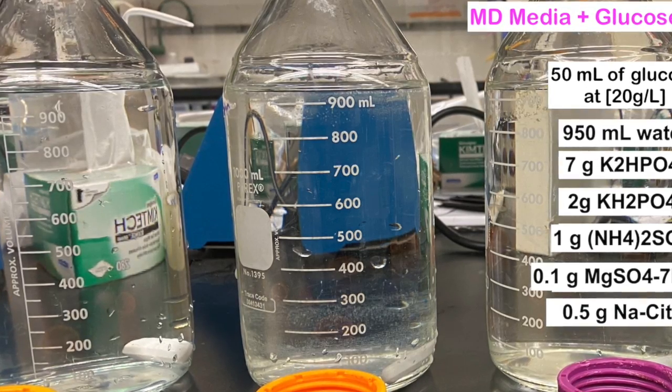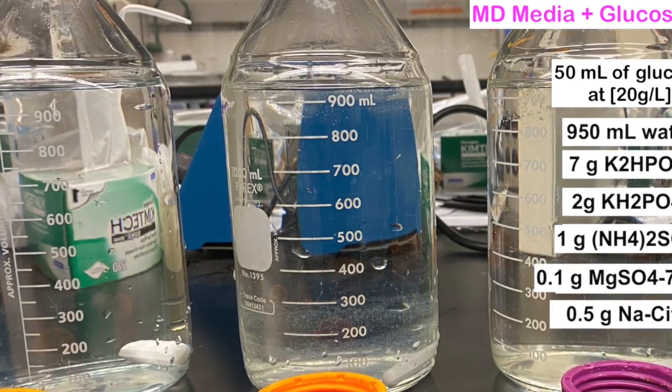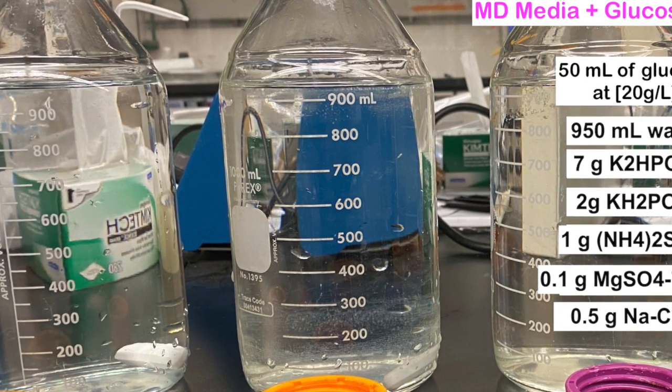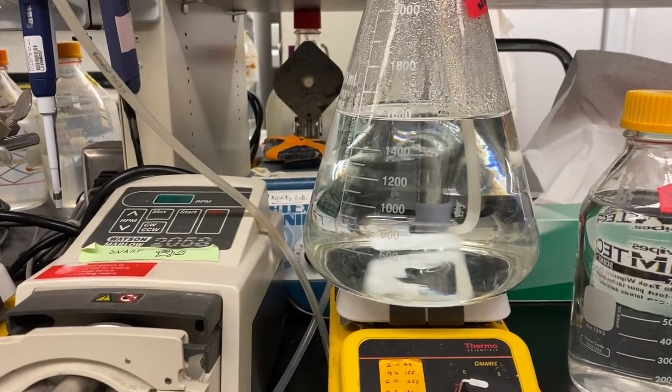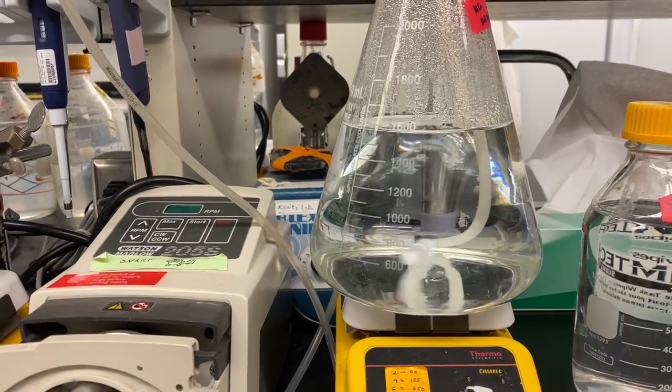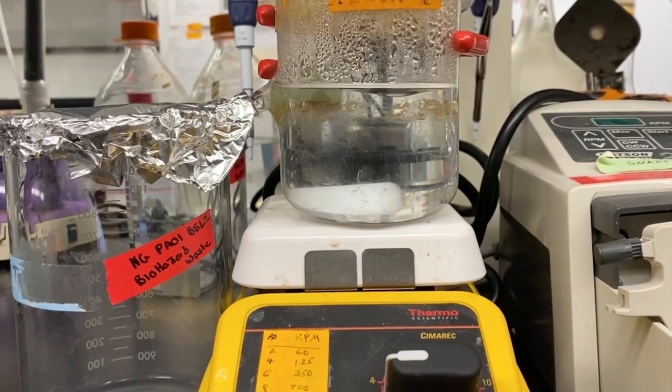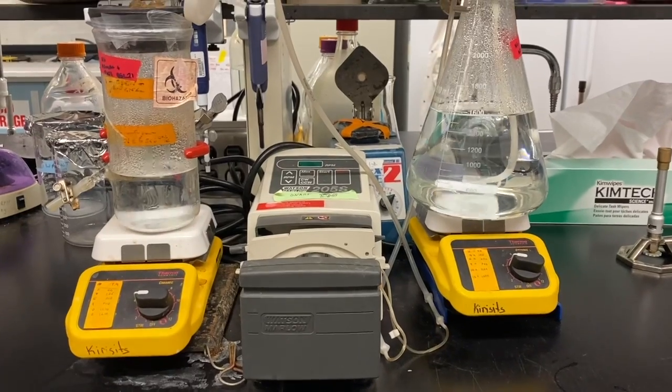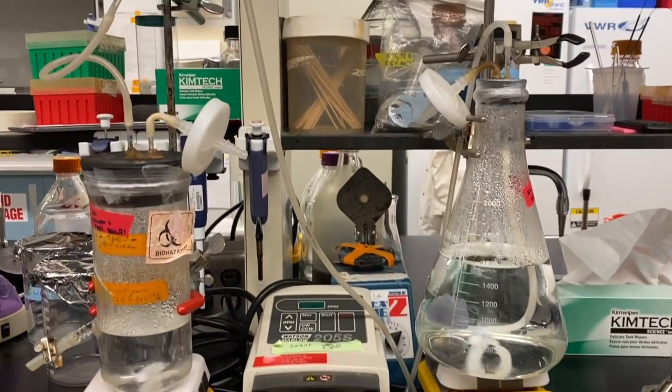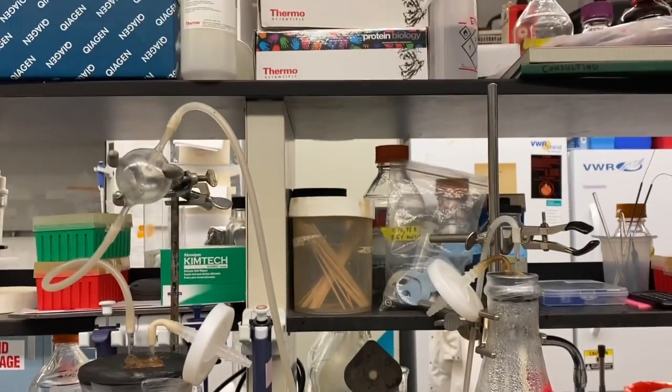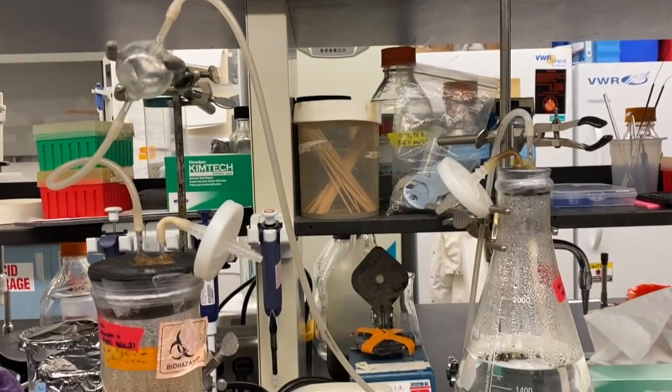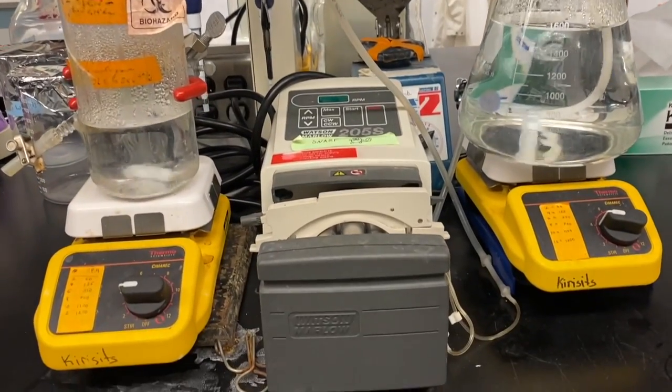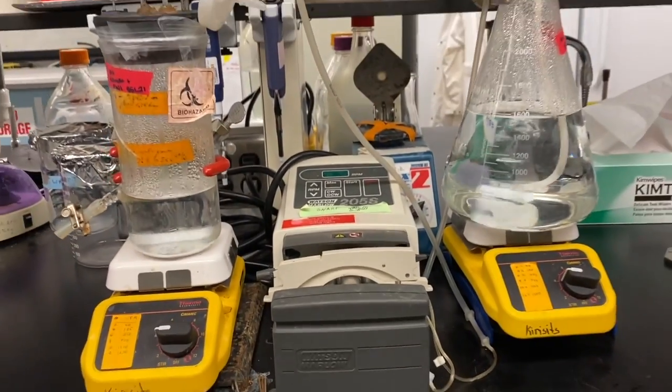The MD media now contains 950ml of water, 50ml of a glucose solution at 20g/L, and various salt species including 7g K2HPO4, 2g KH2PO4, 1g (NH4)2SO4, 0.1g MgSO4-7H2O, and 0.5g Na-Cit. Using aseptic technique, the new MD solution is added to both the growth chamber and the media chamber. In the growth chamber, it is only added up to the outlet height. The clamp on the growth chamber is left on. Tops of both chambers are parafilmed shut to maintain sterility. Both stir plates are turned on and set to the setting of 4.